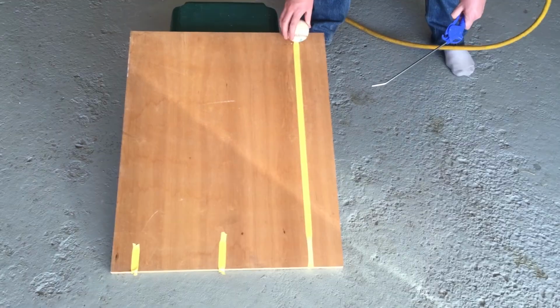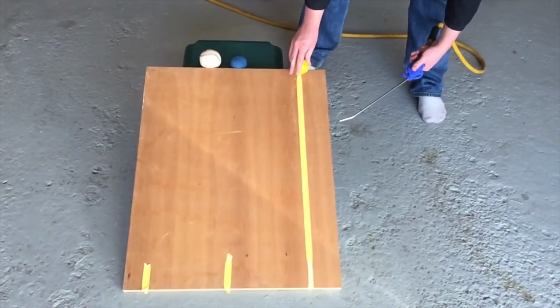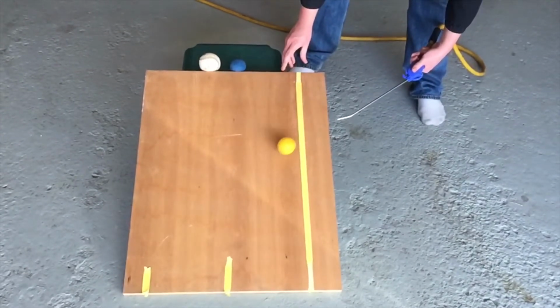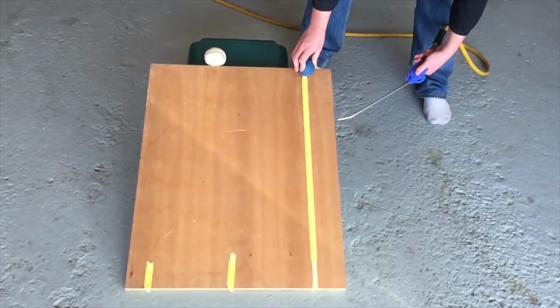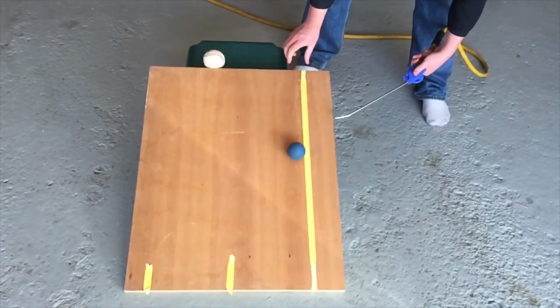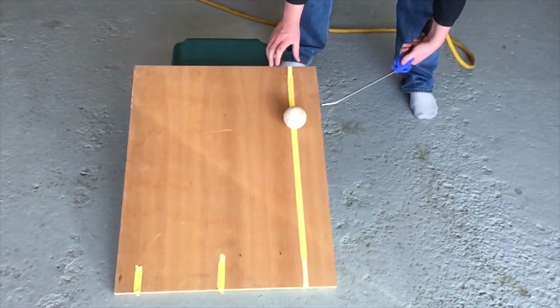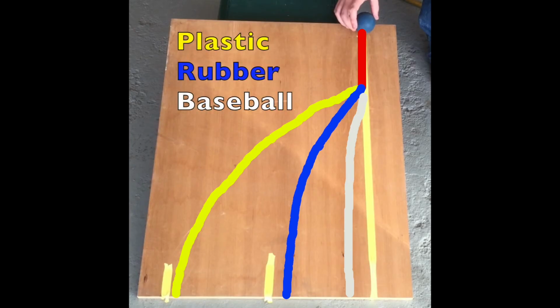In our demonstration, the different balls represent different ions with different masses. The hill represents the accelerating field, and the air blower represents the electromagnet. As the three balls roll down the hill, the plastic ball is deflected the most, the baseball the least, and the rubber ball is between the other two. Assuming that in the demonstration all the balls have a similar charge, this shows that the ion with the highest mass-to-charge ratio will be the one that deflects the least.